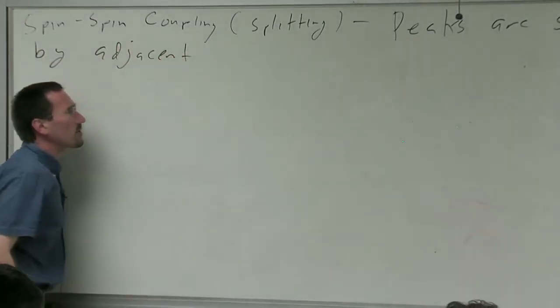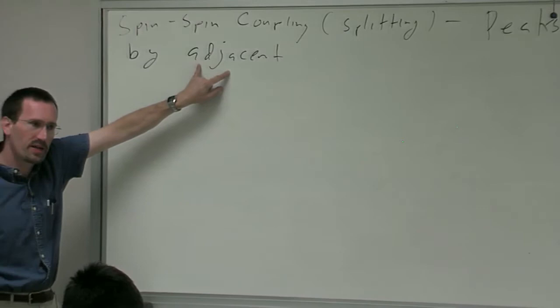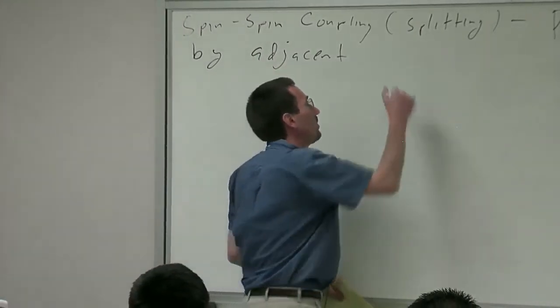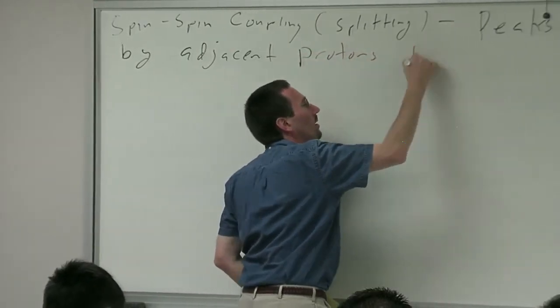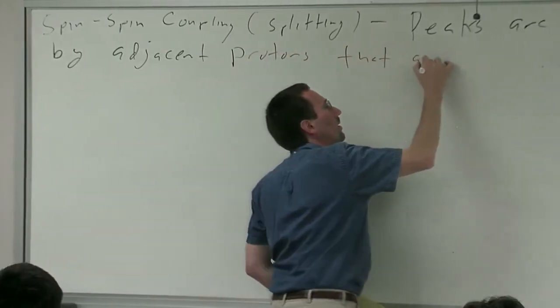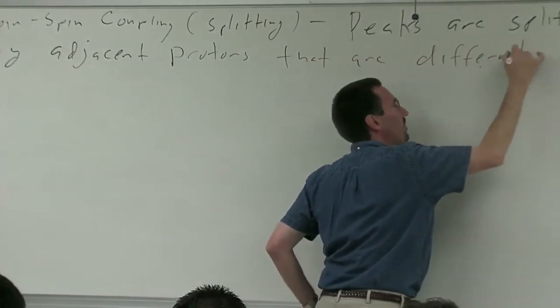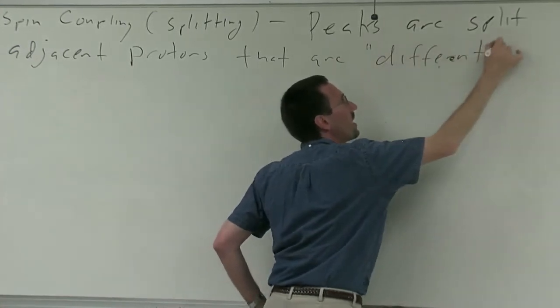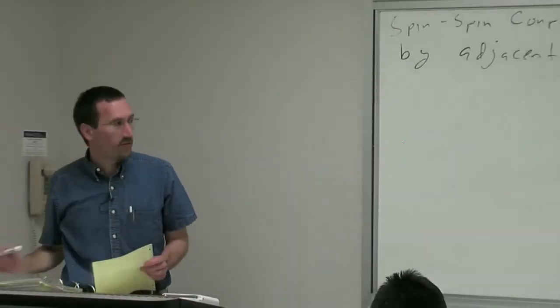And we'll later on amplify on the concept of adjacent, talking about 2-bond coupling, 3-bond coupling, and long-range coupling. But today what I'd like to amplify on is the concept of same and specifically different.